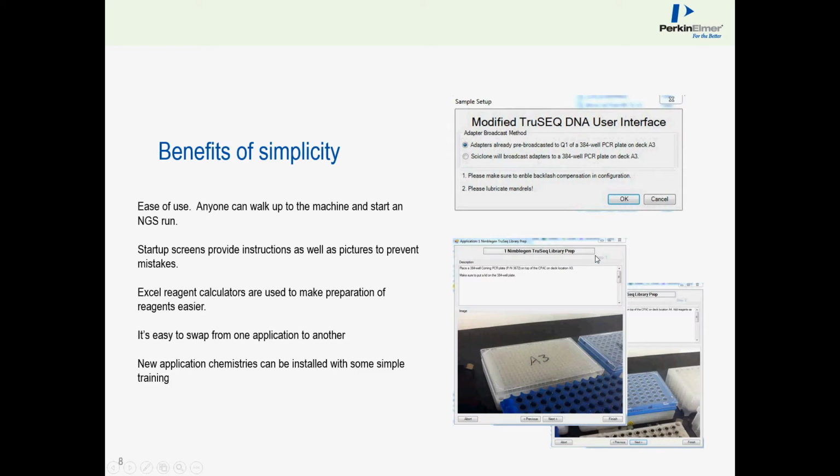and then it takes you to the next step. Okay, and you may notice actually there's two windows that I have over here, and I only have two in this particular example. I'll actually show you what it actually looks like in the actual software in just a few moments. But in this over here, this is almost a setup wizard.